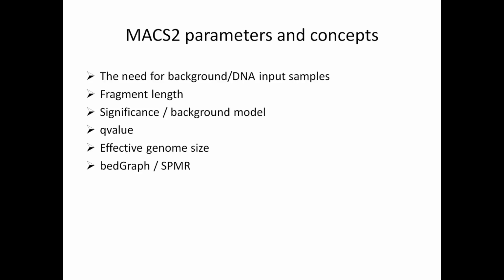Now, the bedGraph file, which replaces the old WIG file, is useful to export fragment coverage data. They can be displayed on the UCSC genome browser or another genome browser, showing a profile of peaks and troughs over the genome for both the chip sample and the calculated background model that is based on the input reads. Other browsers are available, such as Ensembl, the Integrative Genomics Viewer, or the Integrated Genome Browser.